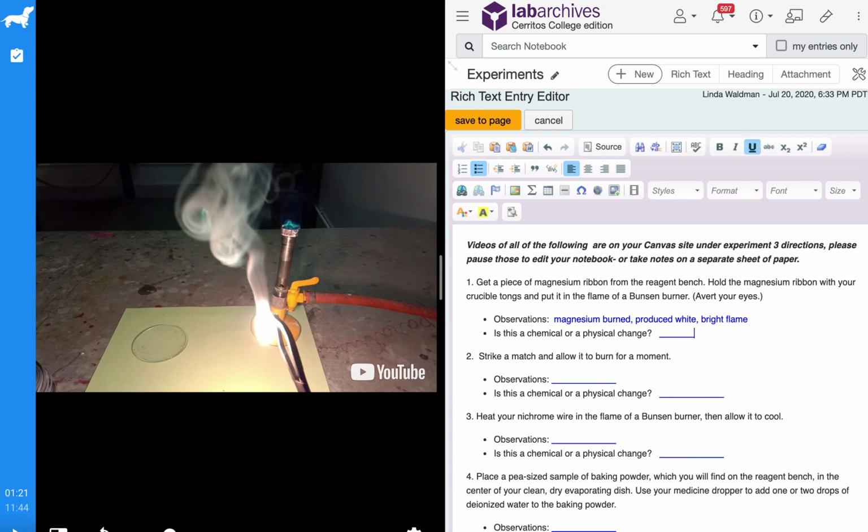So you pick one. Basically, you see magnesium burn in oxygen and it changed the color. It produced the flame. So that's one of the indications, one of the evidence to show a chemical reaction has taken place. Remember, there are 4 evidence you have to memorize: the formation of bubbles, the formation of precipitate, the change of color, liberation of heat or light. So in this case, it is the fourth indication, the liberation of heat, which is the flame, and the light. So it indicates this is a chemical reaction.